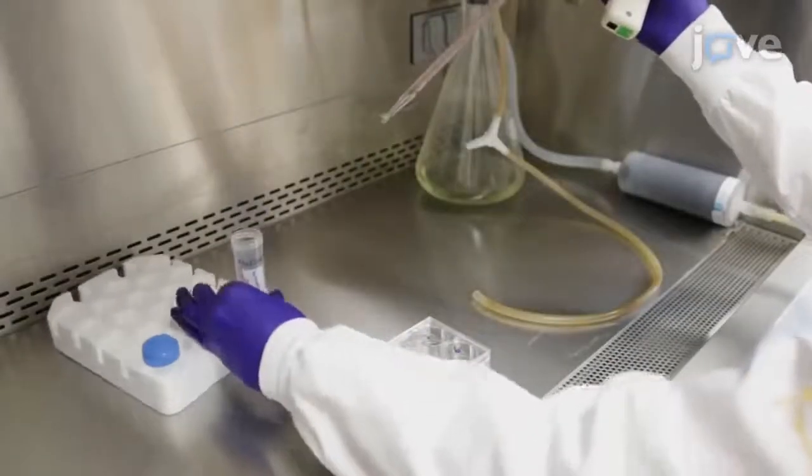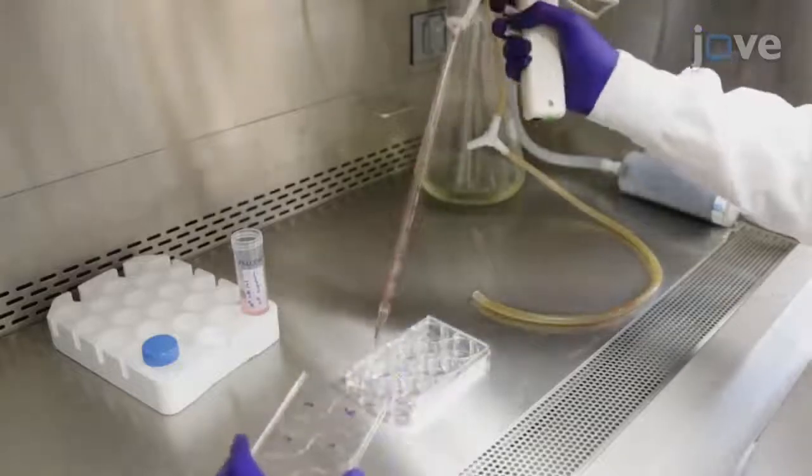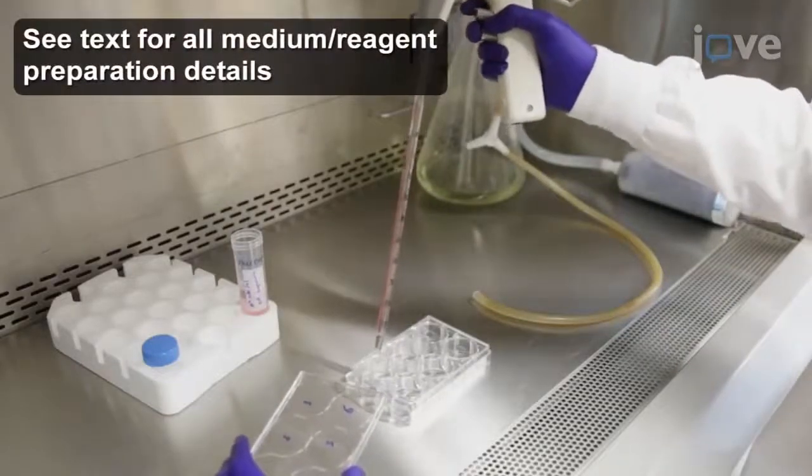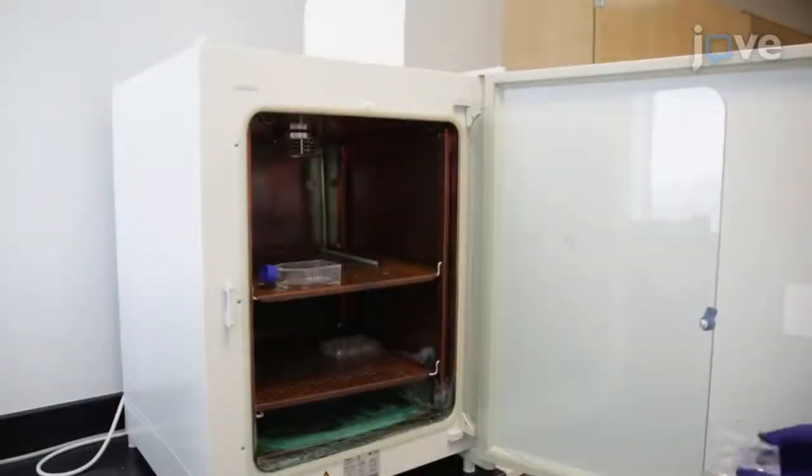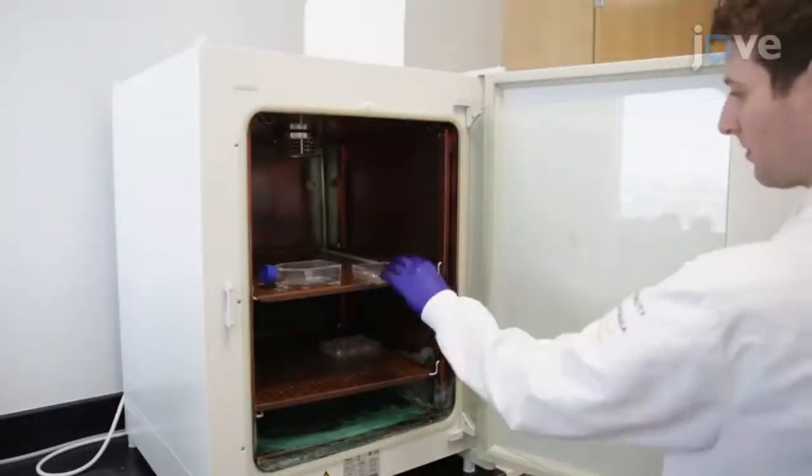Begin by plating 2 times 10 to the 4th cells in 2 milliliters of culture medium into each well of a 6-well plate using sterile technique for a 24-hour incubation at 37 degrees Celsius and 5% carbon dioxide.